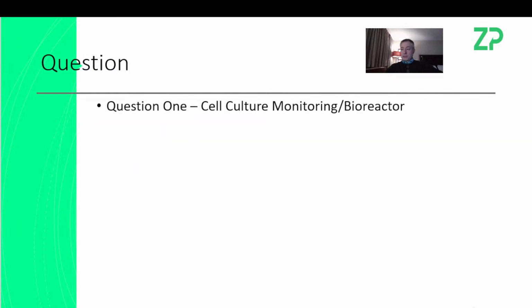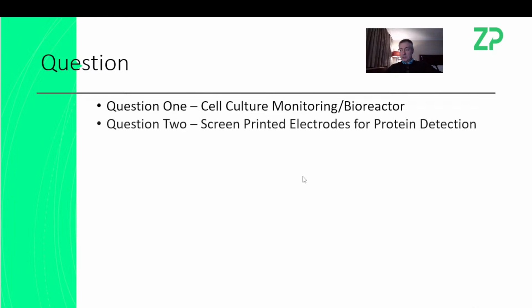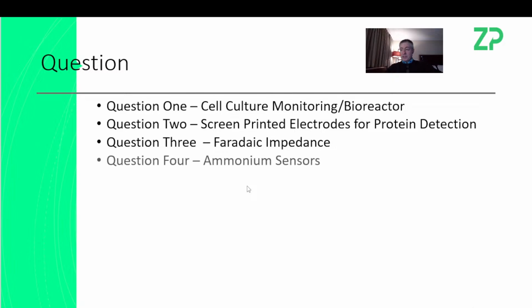So the questions that came in today: somebody's very interested in putting our electrodes, or sensors, I should say, into cell culture and bioreactors. I've actually got a couple of questions around this, so this seems to be quite interesting at the moment. Somebody else wanted to know about screen printed electrodes for protein detection, which I will discuss today. Somebody else, on the YouTube channel, wanted to know about Faradaic impedance and why it was drifting. Somebody else wanted to know some more specs about our ammonium sensor, so I'll cover that.